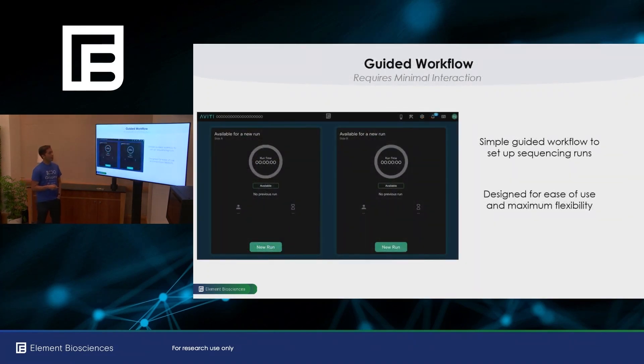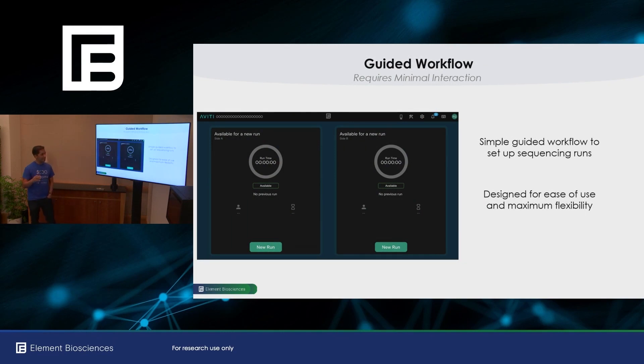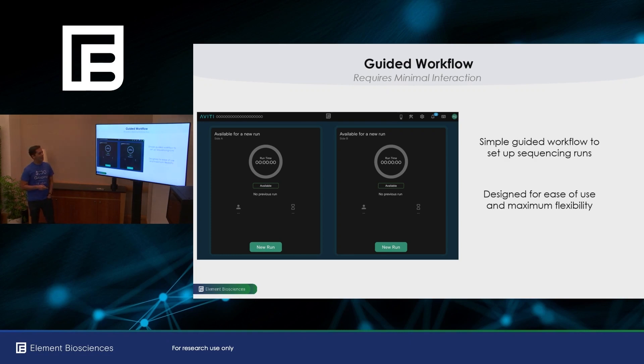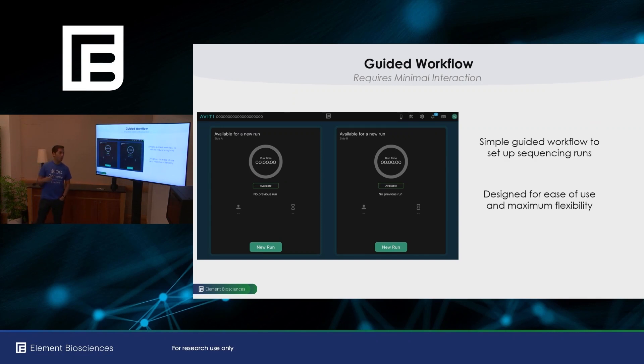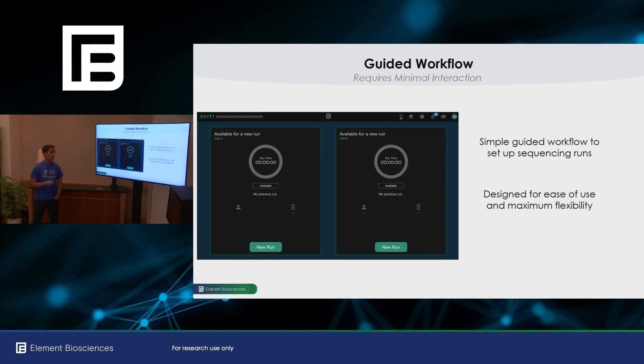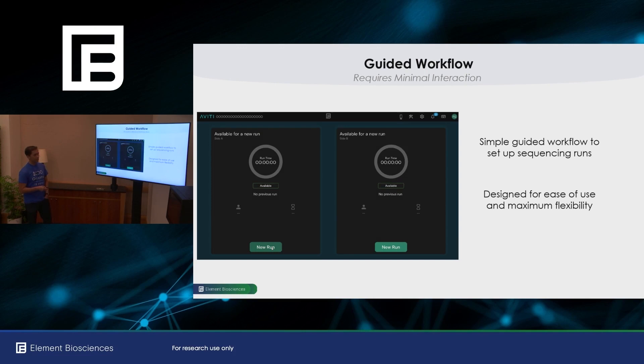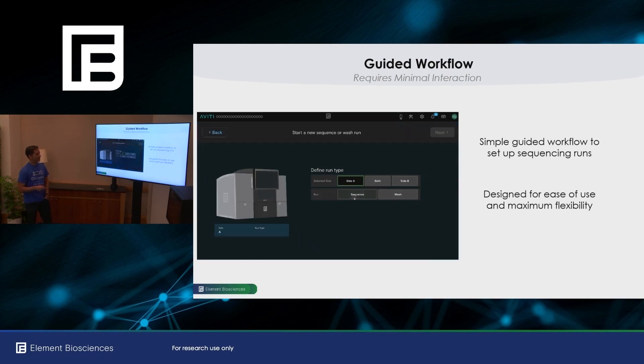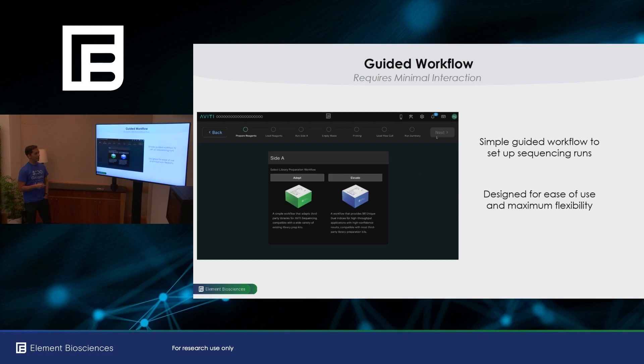So Aviti OS was designed from the ground up to be as simple and intuitive and delightful as possible. Our designers worked very hard to make sure that every interaction is purposeful. We've also gotten feedback, maybe some of you are early users with 1.0, and we've incorporated that feedback, improved the look and feel, and also updated the workflow. So let me walk you through that a little bit. And we have these instruments here, so I welcome you to use them after the talk.